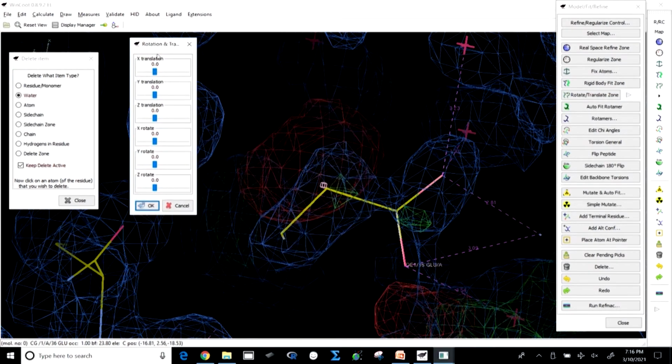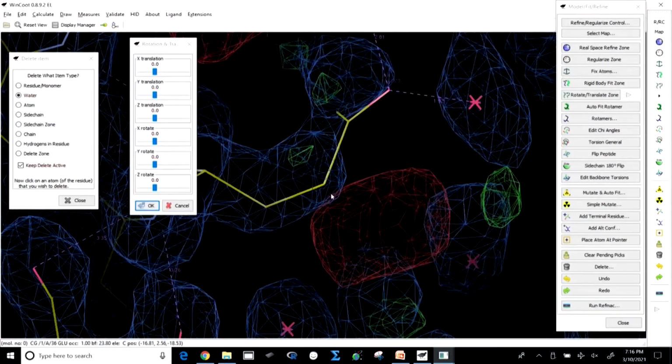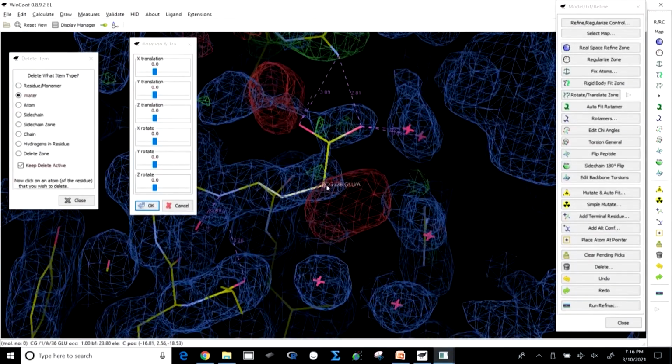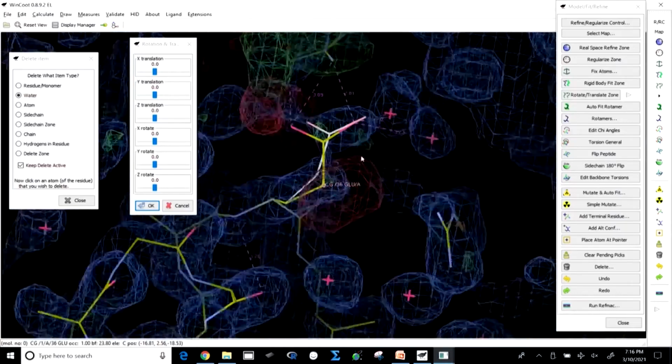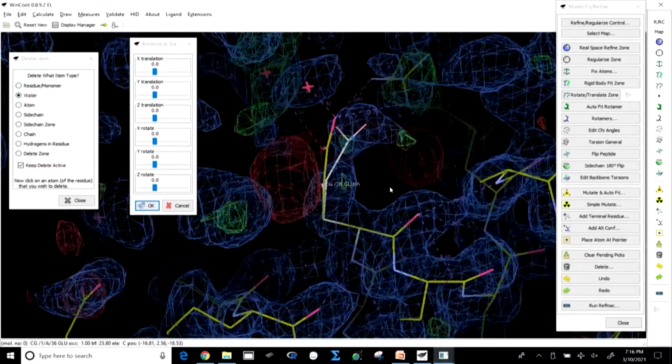So, you accept it and then you could rotate, translate. You could do it by rotating on the x. So, x translation, y translation, z translation, x rotation, y rotation, z rotation, or you could have another method when you are becoming an expert, you could push control, you could directly push those residues, but when you are doing that you would be confident, you would be a good user.